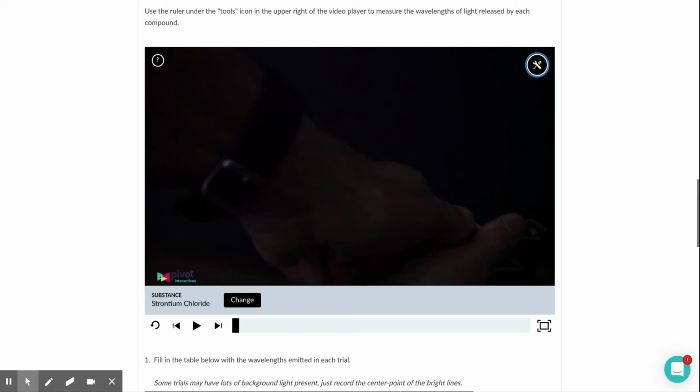Welcome to the Pivot Interactives Flame Test Lab. The first part of the lab is very straightforward. Watch the video, answer 2 questions, and you need those 2 questions to unlock the section that is listed here. I've hidden the first 2 questions, so as not to give away the answers.